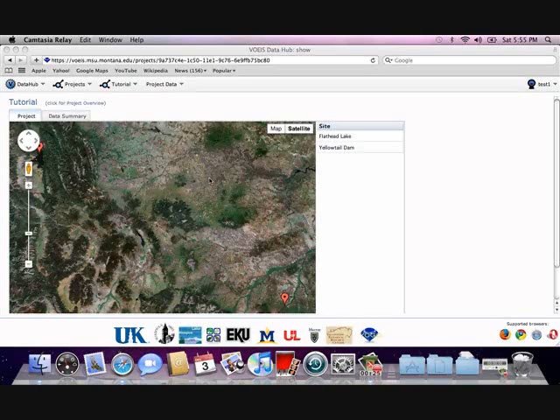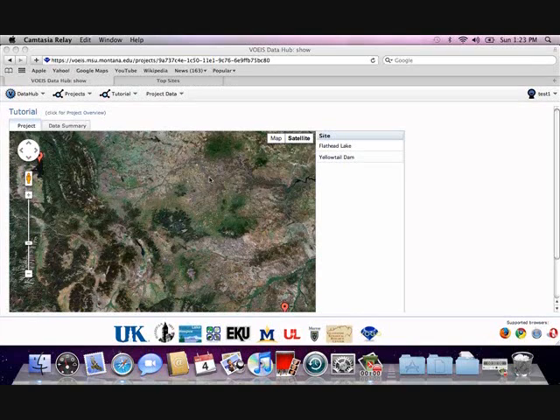For example, a single grab sample from stream water can be analyzed for dissolved organic carbon, dissolved inorganic nitrogen, or calcium concentrations. Therefore, the way data is stored within VOEIS is unique. The relationship between the individual data sample values and sample ID is preserved. The VOEIS workflow for loading data samples is constructed to load data from individual files.